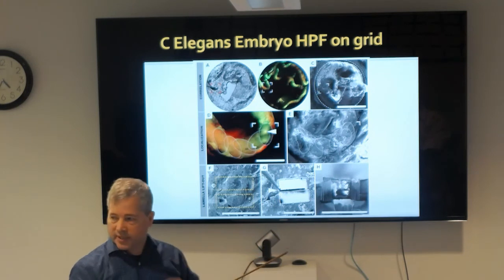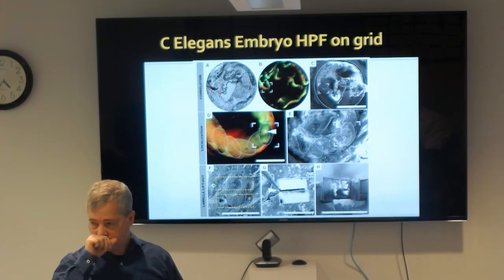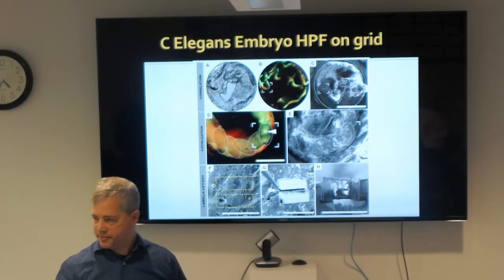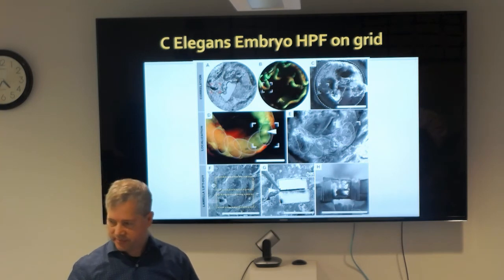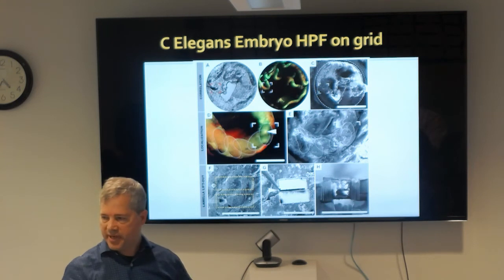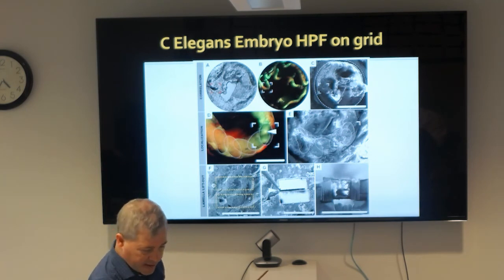So, 2 more questions. So does your setup have a port for installing an EDX detector? We do, but we don't have an EDX detector. And then have you done lift out on frozen at your place? We're trying to do that. We're getting that working, actually. We have almost all of the materials in place for it, but it's just a matter of doing it, and that's taking quite a while. Thank you.